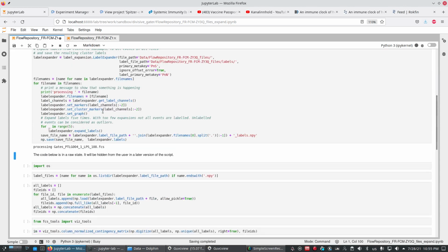And now this thing is going to process how many? 260 files. So let us just stay for the minute it takes to do the first one, and then it will be 260 minutes more if we're lucky that it takes only 1 minute to do one. And so this will go overnight, and tomorrow morning I will show you how far it went, if it succeeded or if we have to do everything anew.